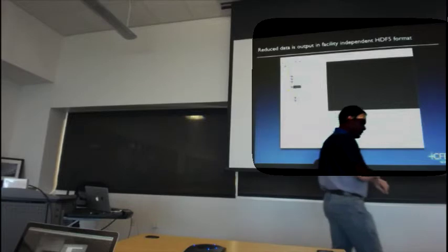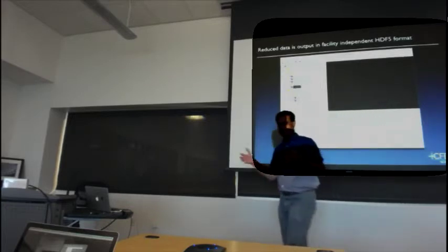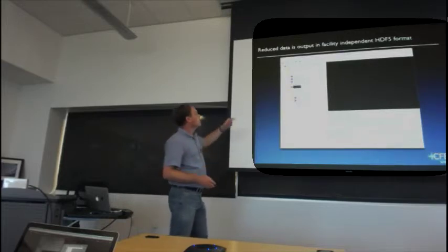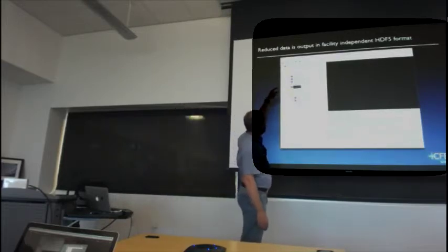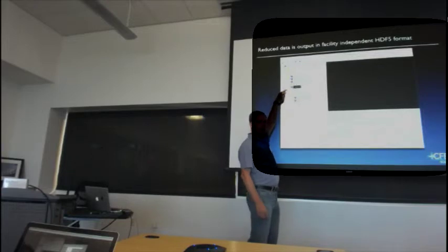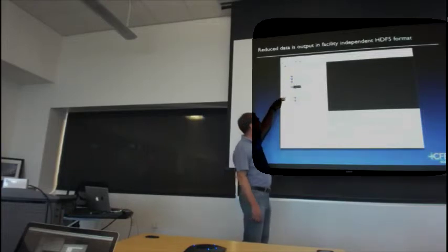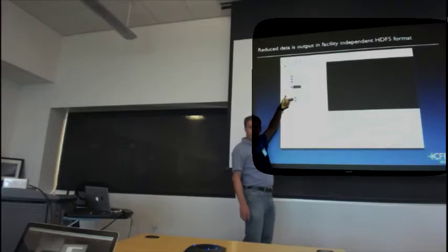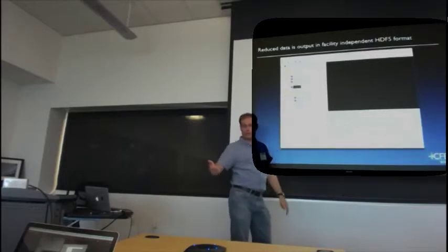Now, for those of you who don't know HDF5, it's basically like a file system within a file system. It's a bit like a zip file, maybe you could think of it. So it's a data format, and within it you have these fields that are named, and you can include lots of different metadata in here. One of the things I do is put in the peaks that I've found, so you can use them for indexing. I put in the peaks that have been found.